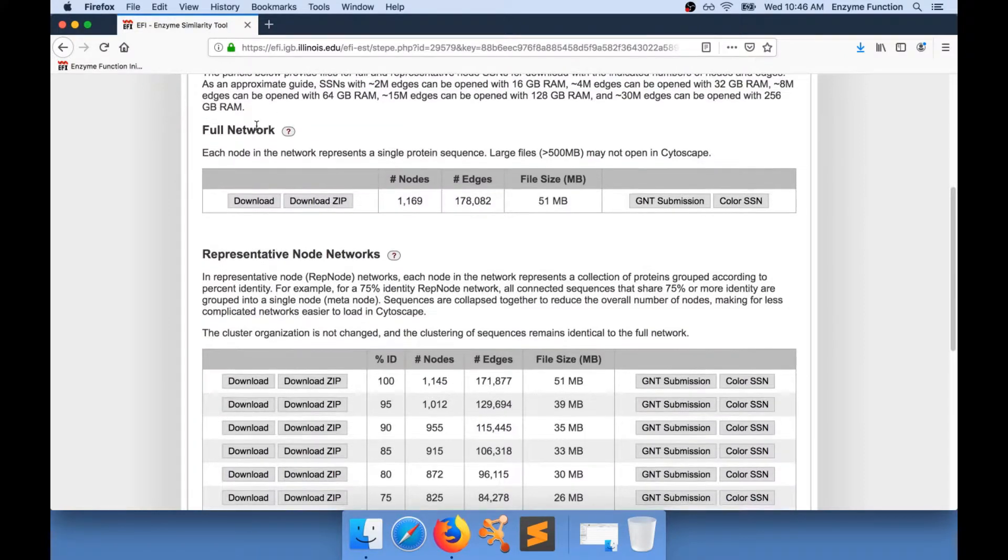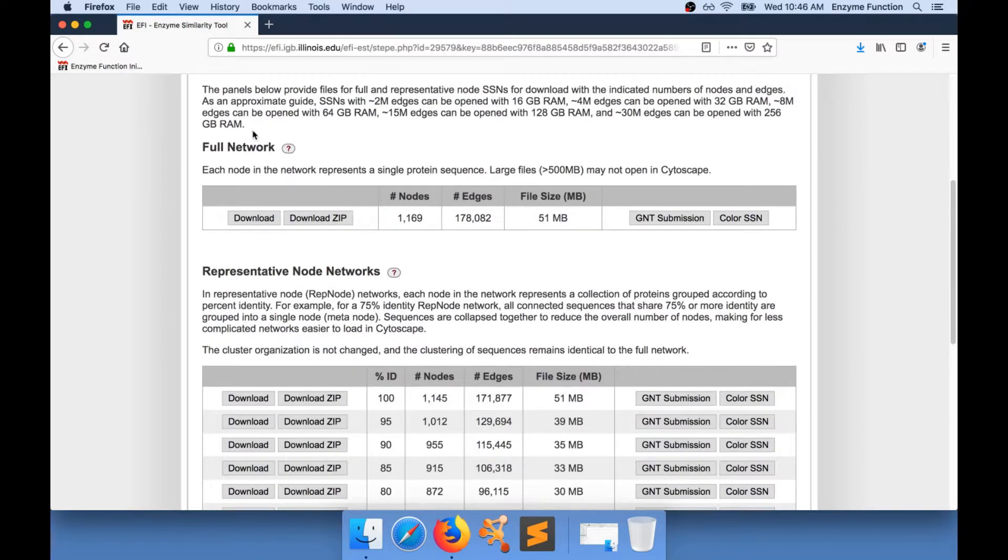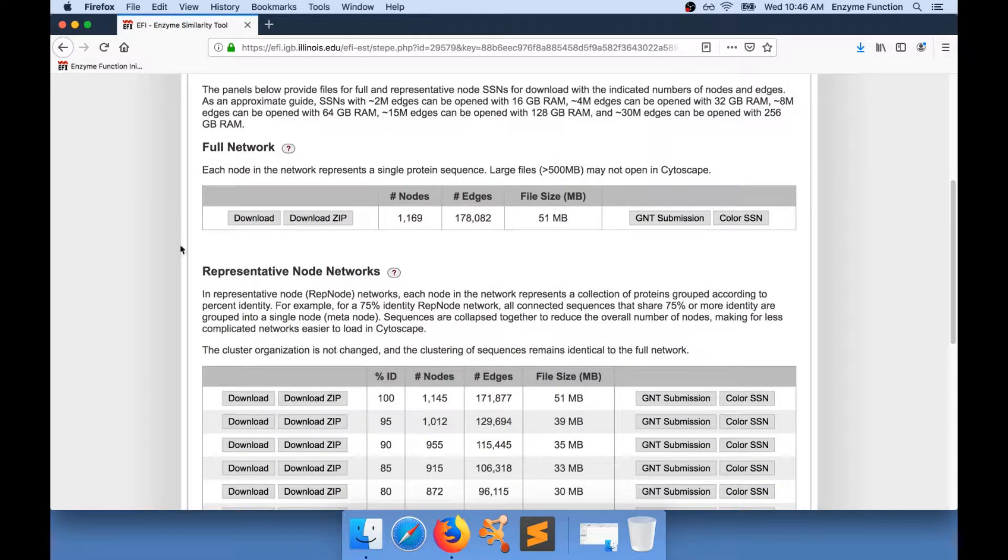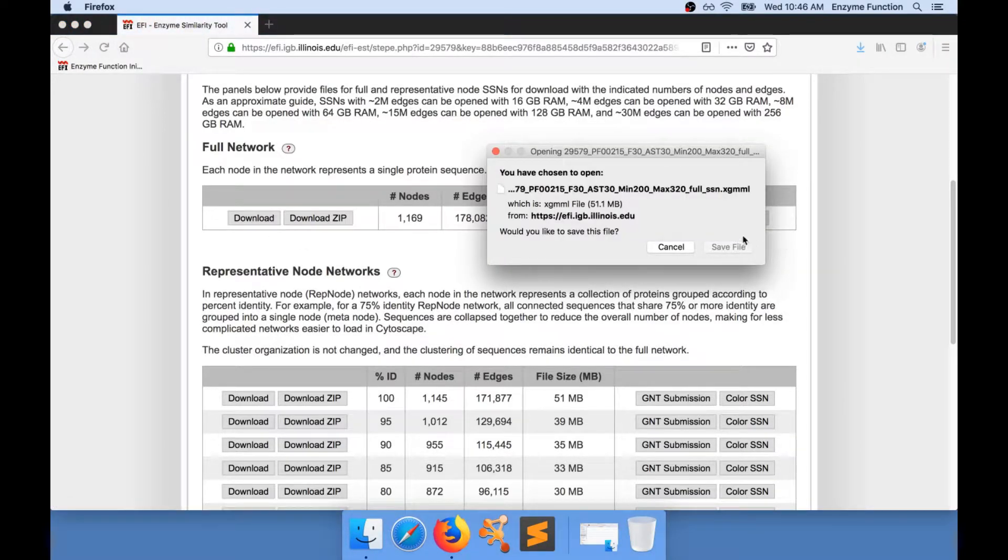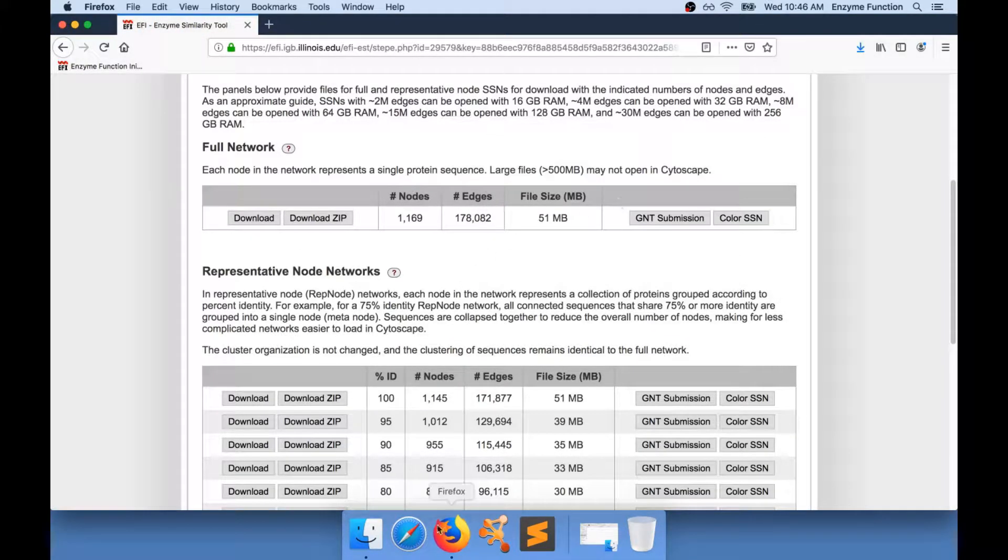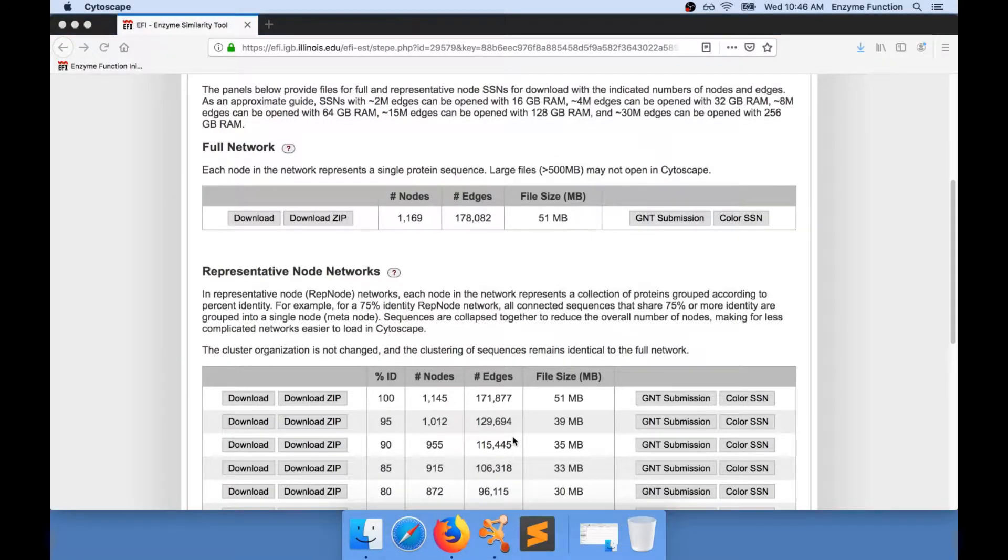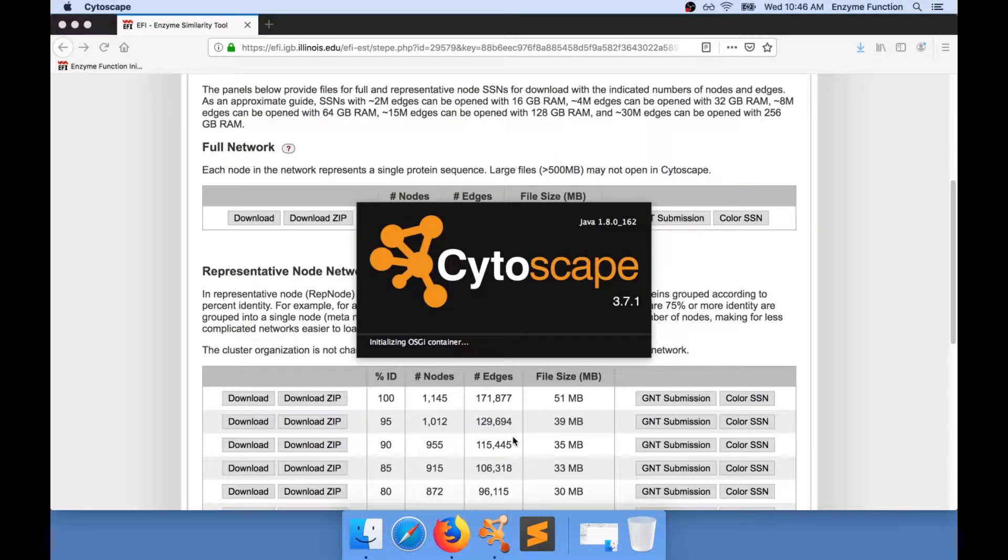All the networks that are generated on the EFI website are in the XGMML format. You will need Cytoscape to open the network files. The current version of Cytoscape is 3.7.1.